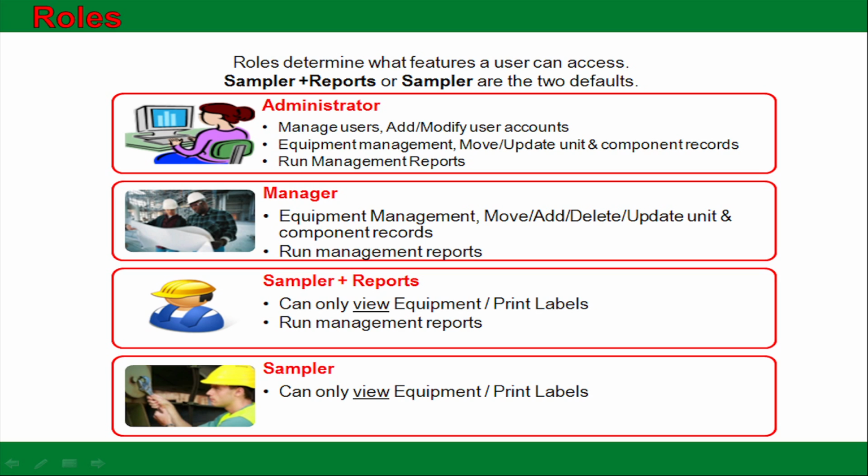the equipment and view all the sample reports. They can even create labels and use advanced graphing. They have all the great functions any user could possibly need. They simply cannot delete or modify the equipment.